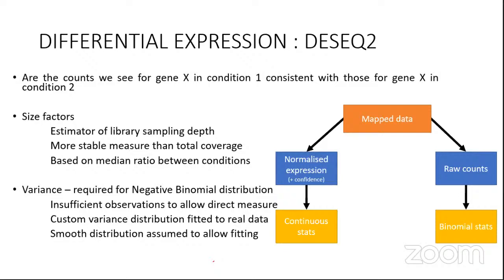So I told you that you can use Cuffdiff to get the genes that are differentially expressed. Now, how to do the analysis? There is a tool called DESeq that can be used. So DESeq2, DESeq, edgeR, limma, these are the R packages to do the differential expression analysis.